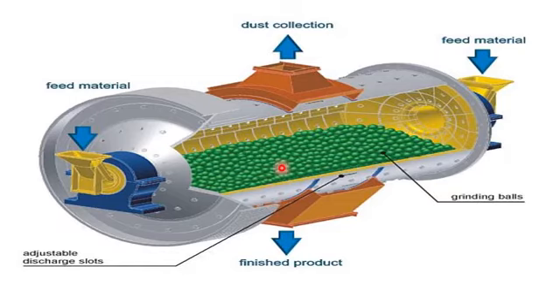Dear students, just for your information, in nanotechnology, high energy ball milling, which is also known as a mechanical deformation process, is more frequently used for producing nanocrystalline metals or alloys in a powder form. So the high energy ball milling method is a type of ball milling method. It is more commonly used in producing nanocrystalline metals and alloys in the form of powder. This technique belongs to the top-down approach.